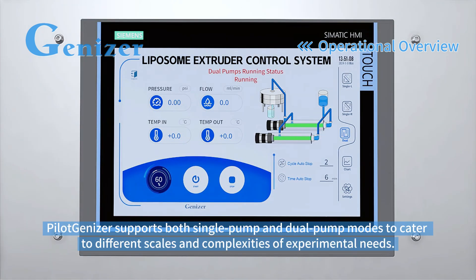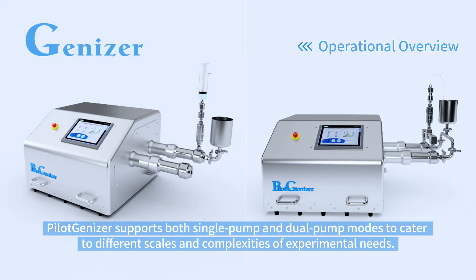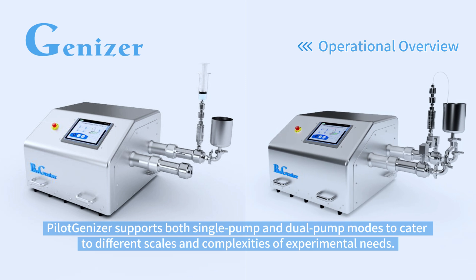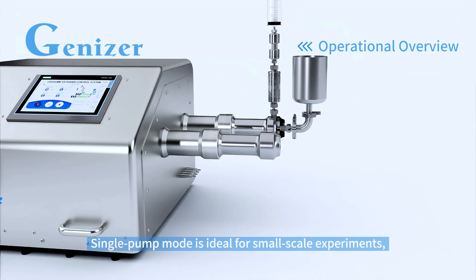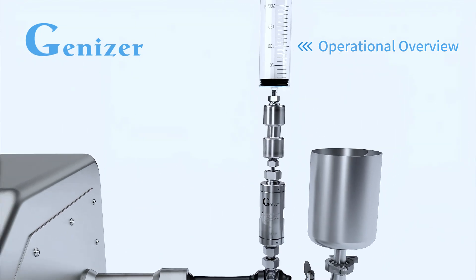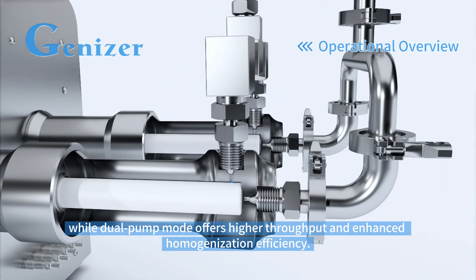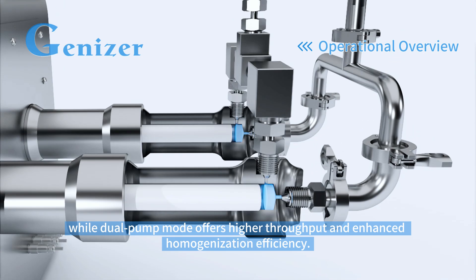Pilogenizer supports both single pump and dual pump modes to cater to different scales and complexities of experimental needs. Single pump mode is ideal for small-scale experiments, while dual pump mode offers higher throughput and enhanced homogenization efficiency.